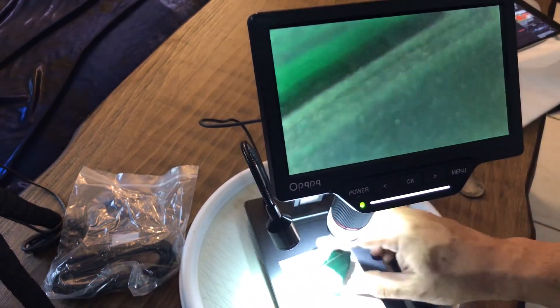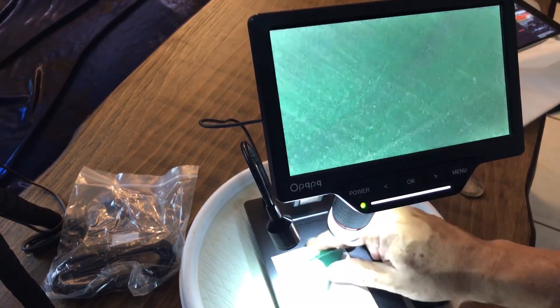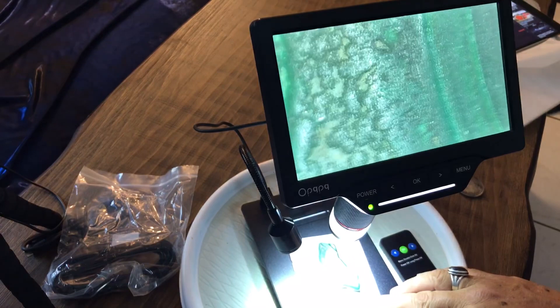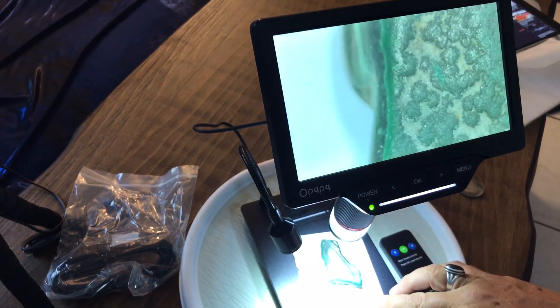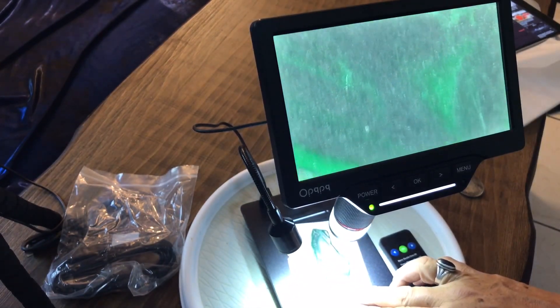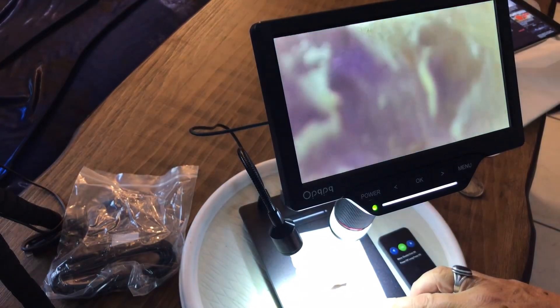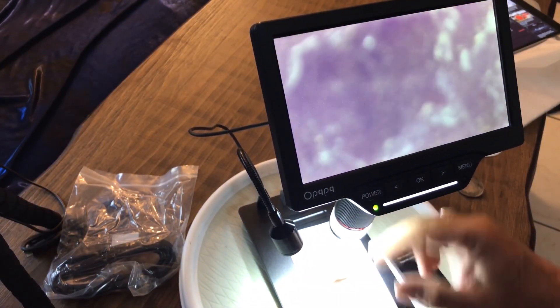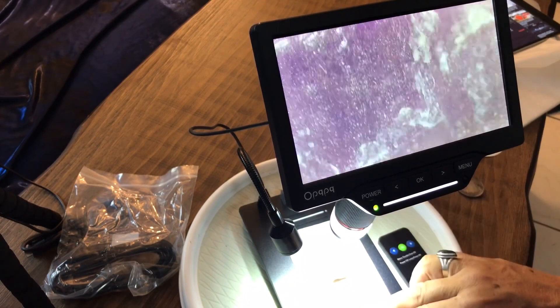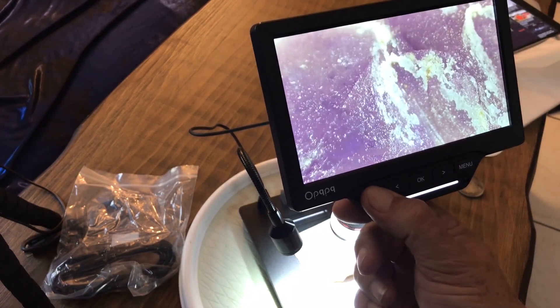Let's check out some other stuff. Got some nice pieces of rock — let's see if we can get some focus. Got some pretty textured rock, and you can see how well it was polished or not. Let's follow this little pattern of dots here — kind of neat. Here's an old dusty piece of amethyst that's been kicking around in my closet. Let's see if we can get some focus on that.